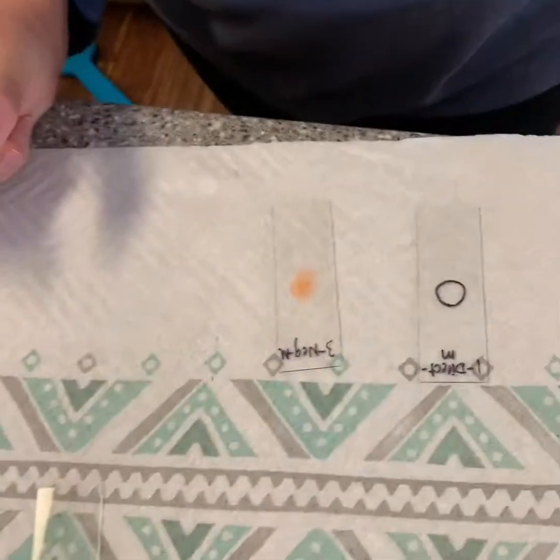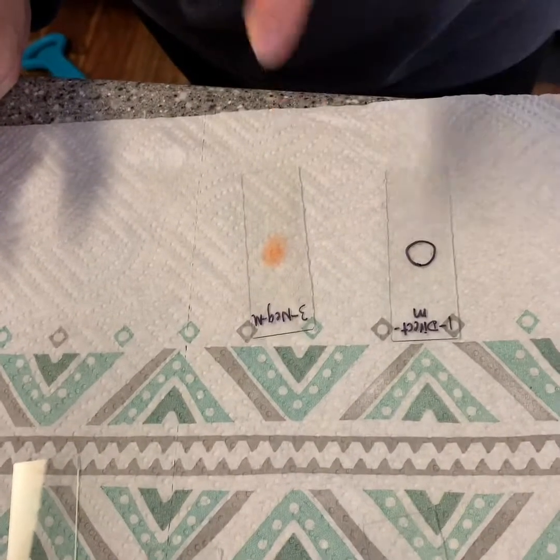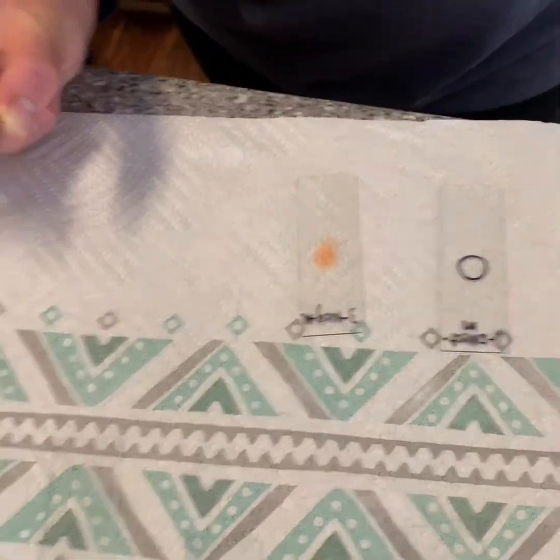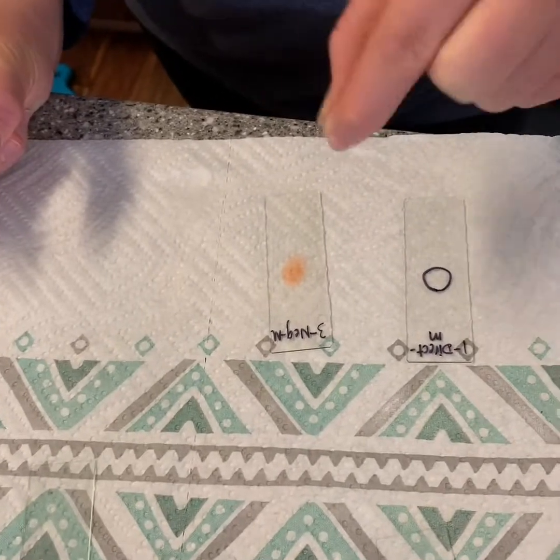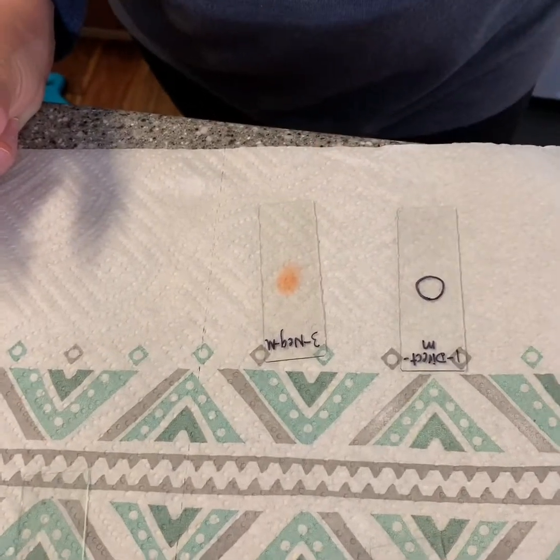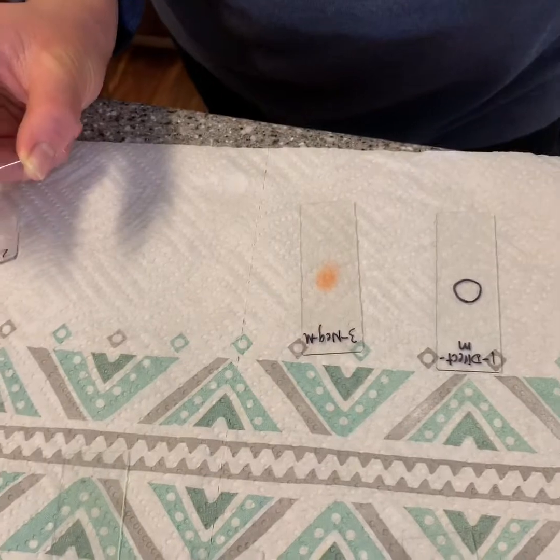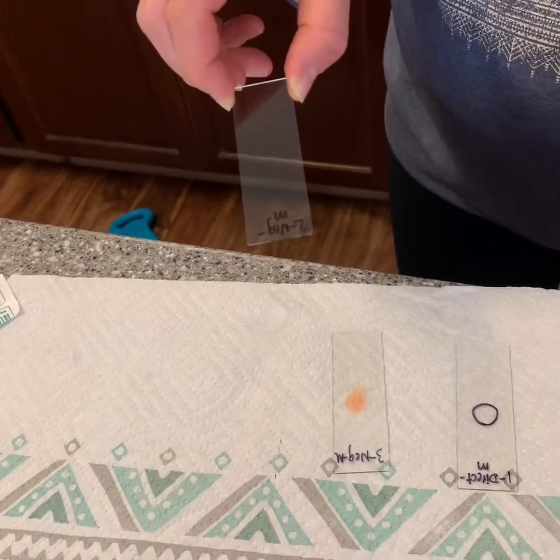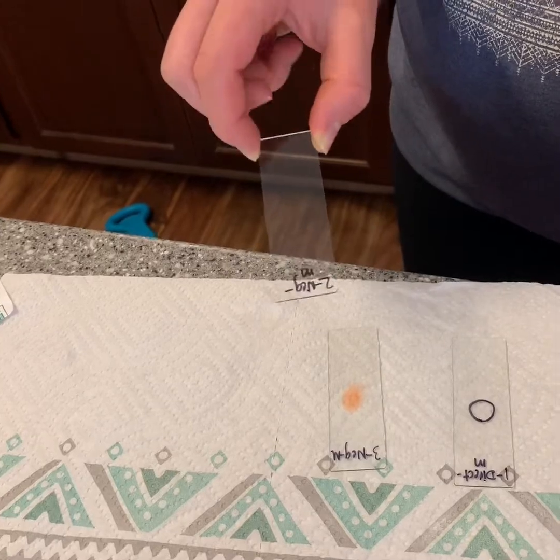I have placed my congo red drop of dye on my slide and I have swabbed my mouth and, with a circular motion, placed it inside the dye. And now I'm going to be taking my other slide and I'm going to be sliding it at a 30 degree angle on top.